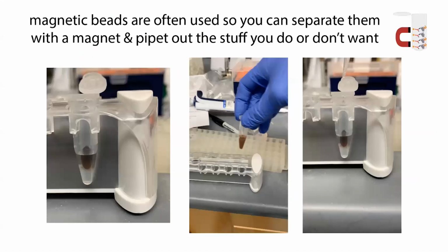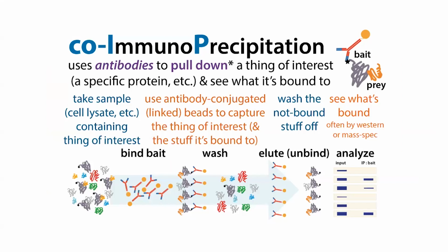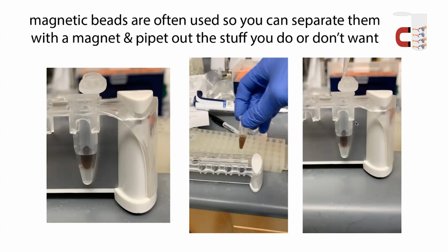In any of these cases, what's common these days is the use of these magnetic beads, which are really cool. Basically, you take your sample and you mix it with these beads after you wash those beads a bunch. The beads provide a way to separate the beads from the liquid. You're going to be doing a series of washes, where you're going to want to isolate the beads from the rest of the liquid, and pipette out the rest of the liquid. And these beads make it really easy to do it.